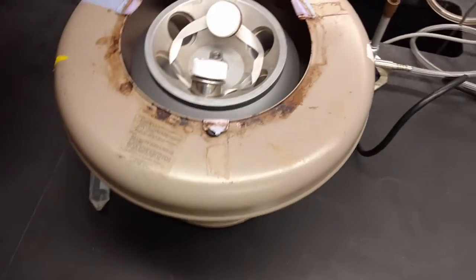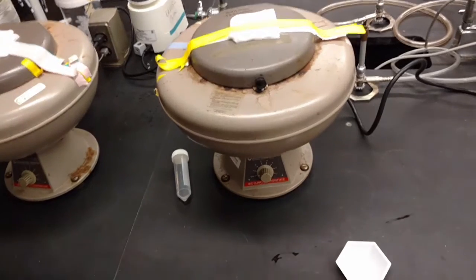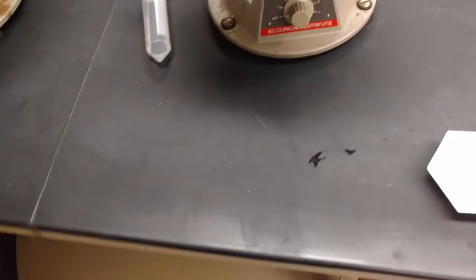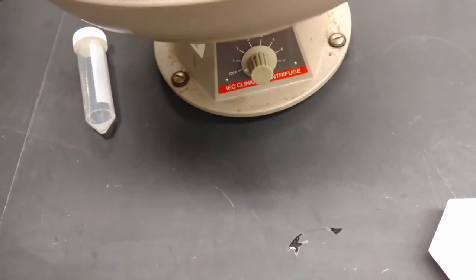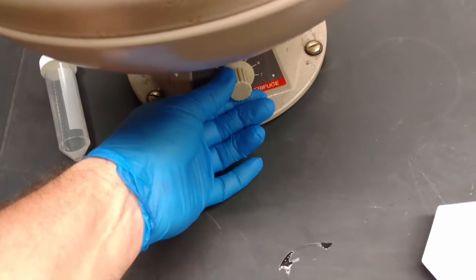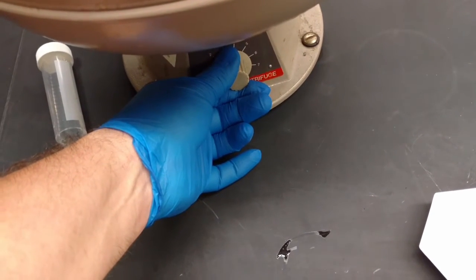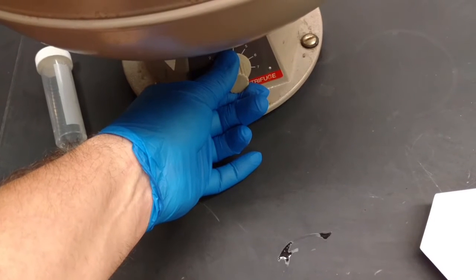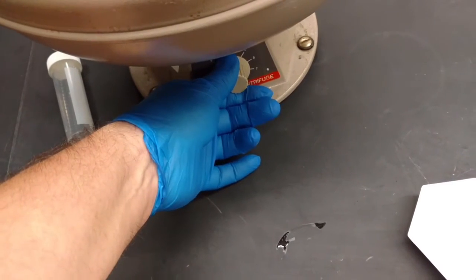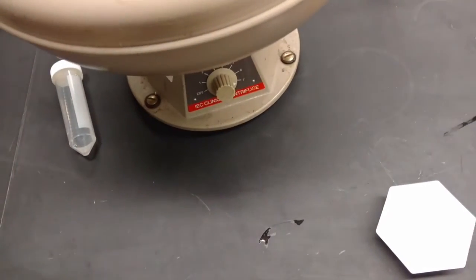These very old centrifuges don't lock when you close them, so be very careful when you close it — it's going to be noisy. The lab manual gives you a speed, but these old ones don't have actual RPM listings on the dial, so we're just going to go max speed. We'll let it spin for 10 minutes and I'll pause until the spin is done.